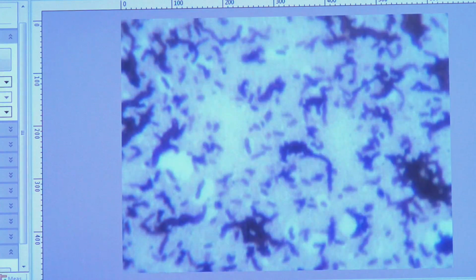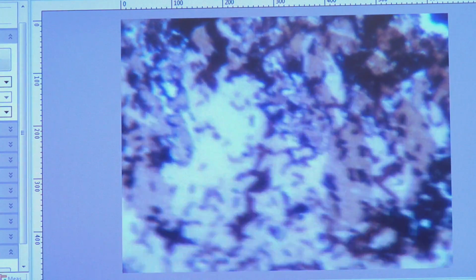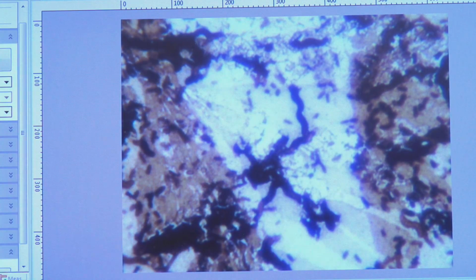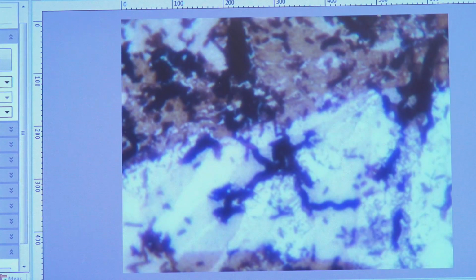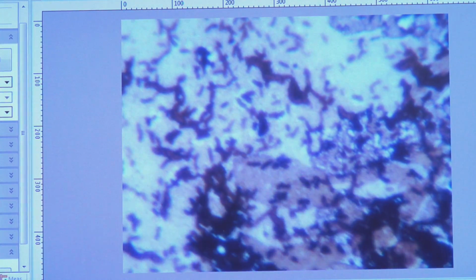That's unfortunate, but part of the purpose of this class is for you to be able to identify what is correct, and so that's why I'm making this video, right? To show you that's what you're looking for. This other stuff is not what you're looking for, okay? And so kind of on point with that, let me go ahead and just change this around a little bit so it's easier for me to find something. So something like this.